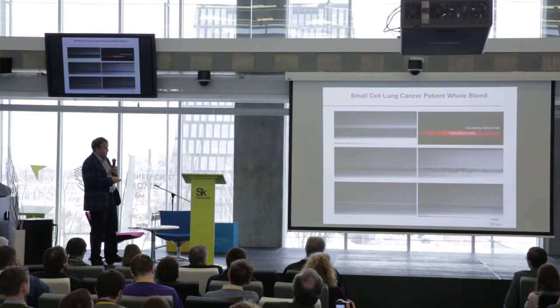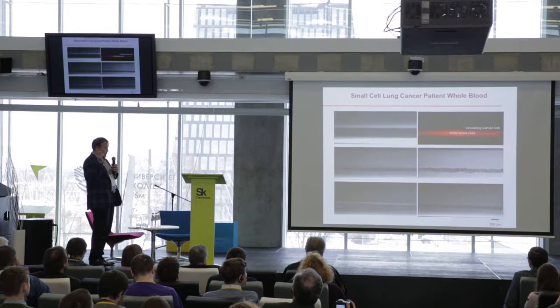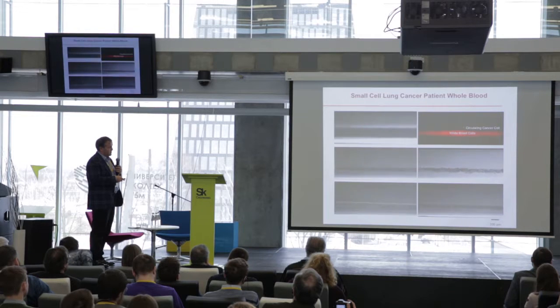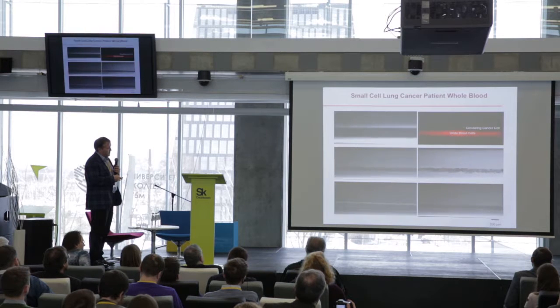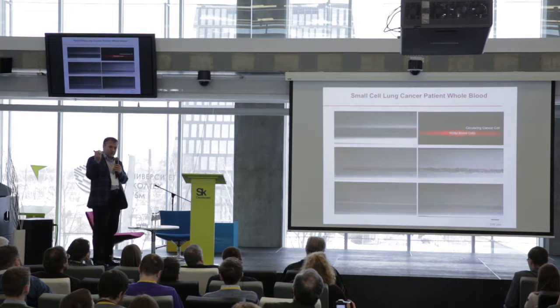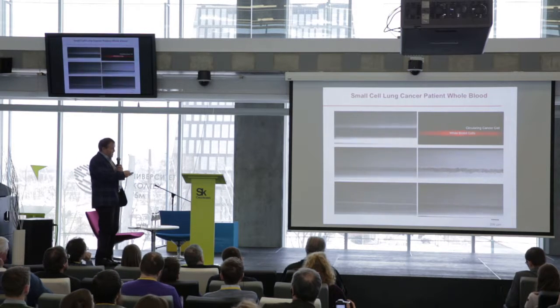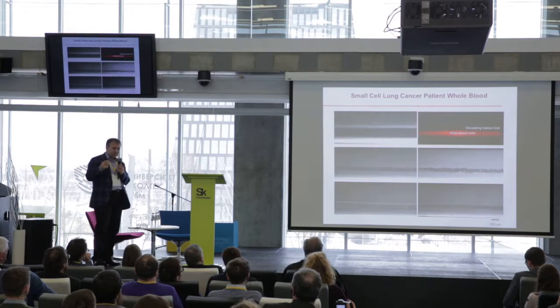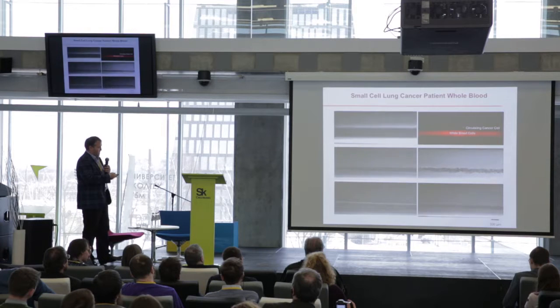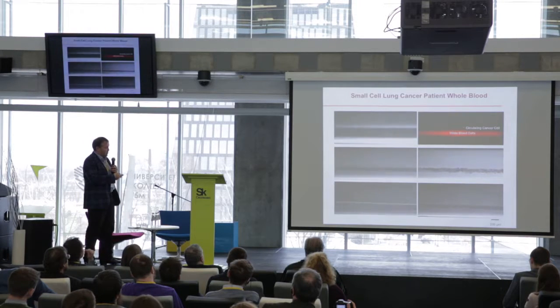This is the blood that we have taken, we have gotten rid of the red cells, and we loaded it here. We stained the white blood cells, and we put cytokeratin into the system also, and we realized that we don't only detect the single cancer cells, but we also detect these gatherings of cells, which are called circulating tumor emboli. You cannot really capture these with current technologies because they are too large to pull. But in our system, since their densities are also the same as the others, you can pull them out.